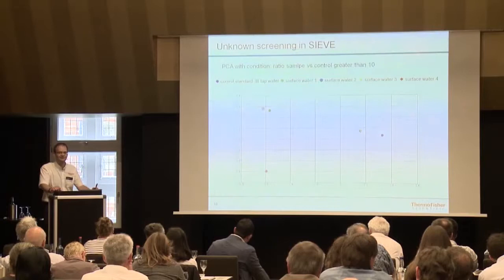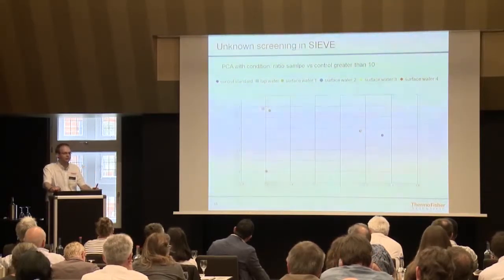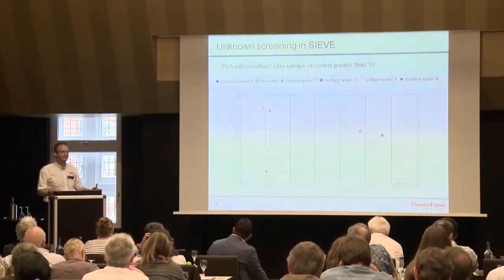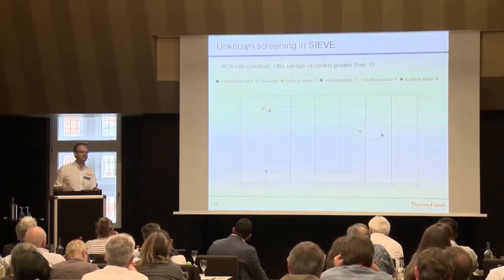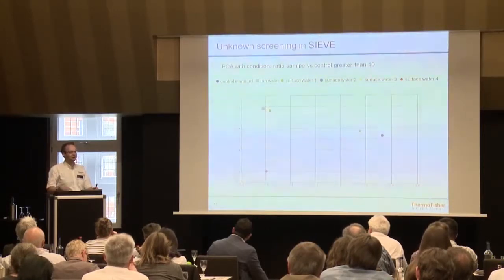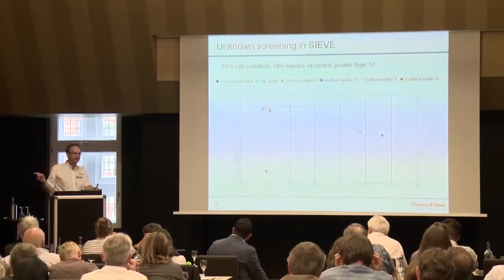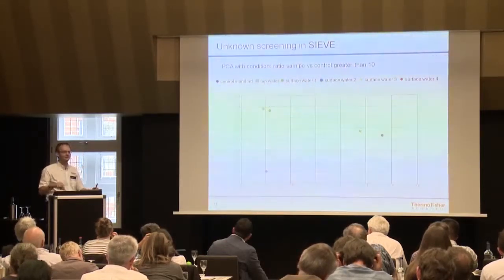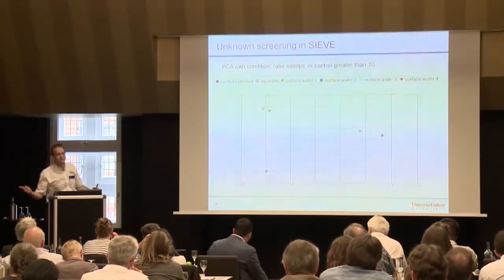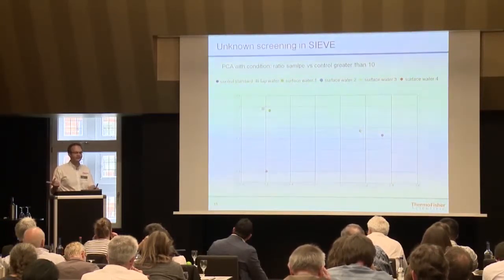So what had happened? Obviously, someone contaminated the water of that lake. And they quite quickly could put it down to a plant which was located at the shore of the lake. They really, during the night from Saturday to Sunday, just opened a basin and let the water flow out and contaminated the lake. And by doing such an analysis, they very quickly could find out what was the contaminant, so they could nail it down to that factory, and they immediately first could do the proper cleanup so the water didn't get into the water supply of the city of Berlin. And second, they could sue the factory to pay for all that cleanup.